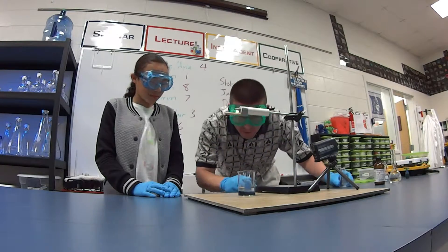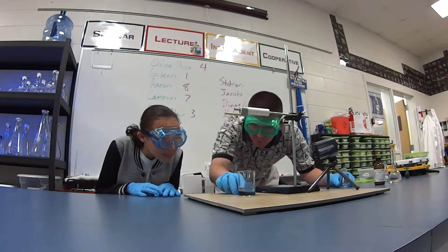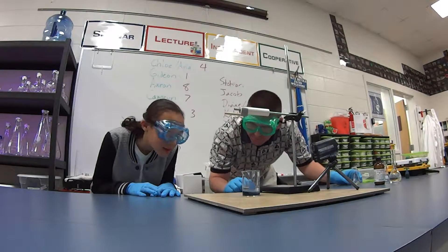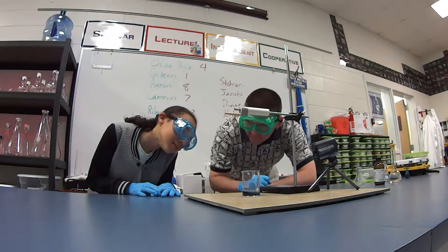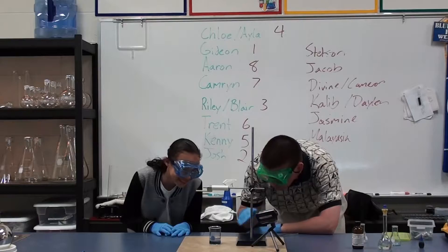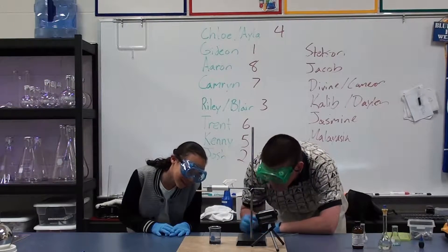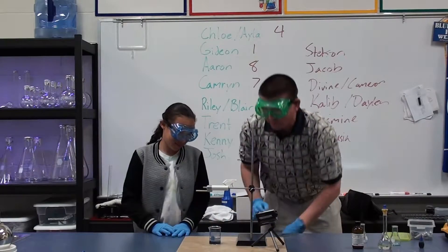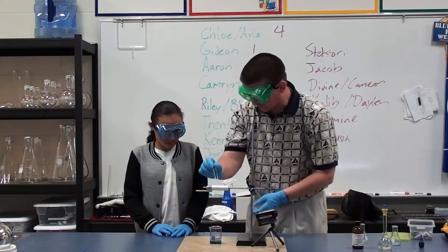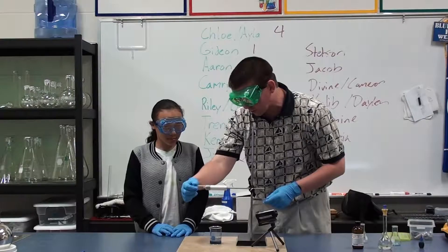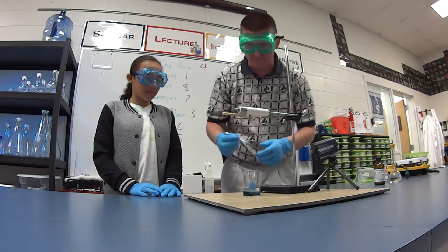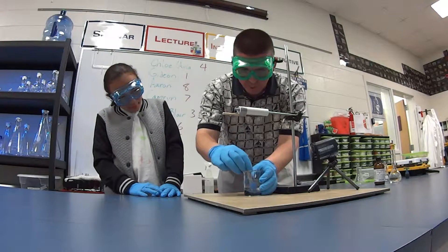If we look at that, you can see we've got our layer of blue and our layer of clear. And then something else is happening in the middle there, isn't it? Something is kind of floating on top of the blue and underneath the clear. What I'm going to do is reach in and grab it and pull it out, and we're going to put it up over the top of this little spool that we've made.